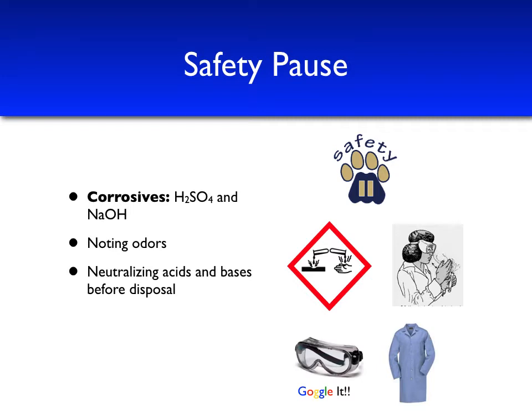In this experiment, we will stir the solution with a wooden applicator stick and waft the smell from the wooden applicator stick towards our nose to note the odor. It's also important to note that we will neutralize all acids and bases before disposing of them down the drain.